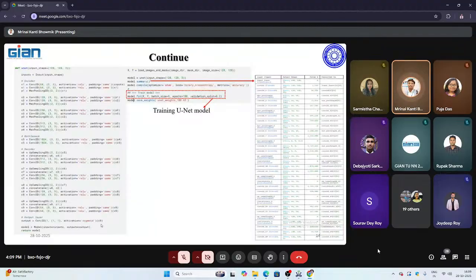It gives only 0 or 1. So in this way, binary masks have been generated. Then this is the whole model, as I have shown here, model.summary. The model is shown through this function .summary. It gives this kind of output as a chart.